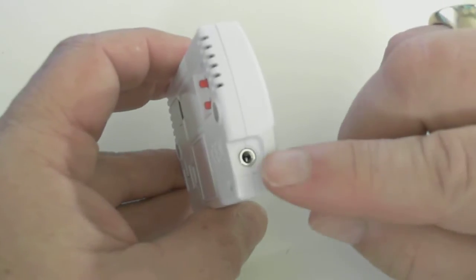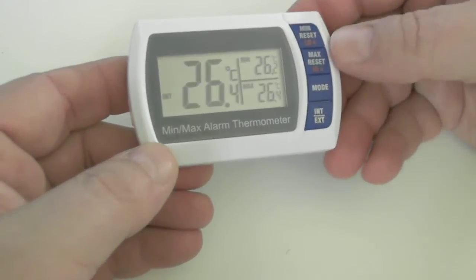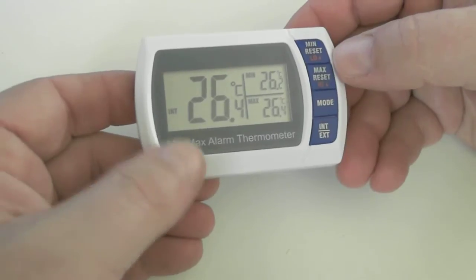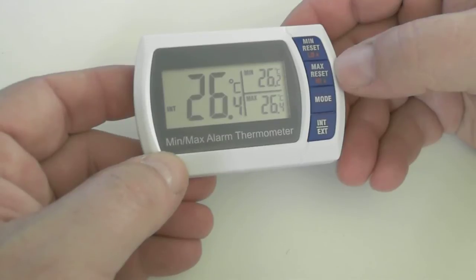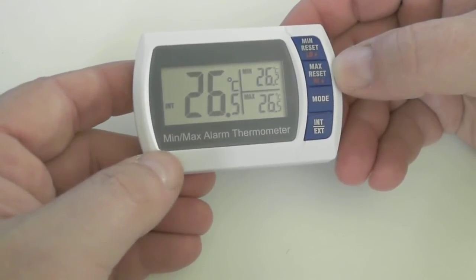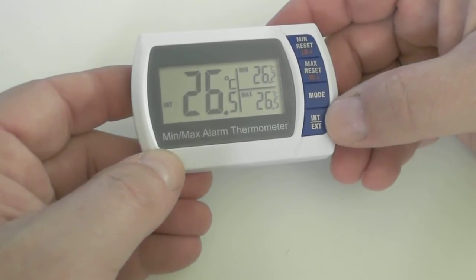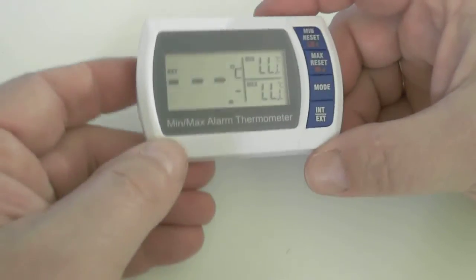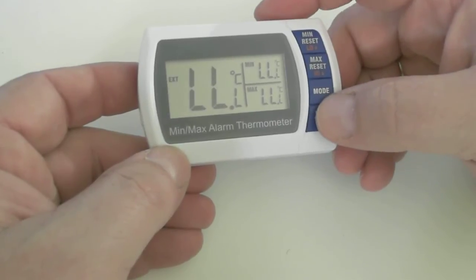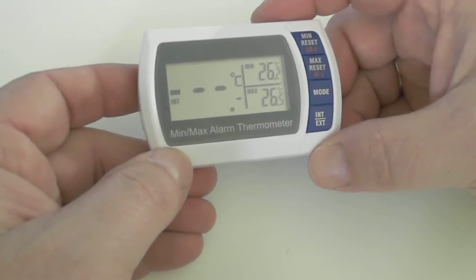Turning the unit over to the side, you have a jack that's used for external bottle probes or probes. And now to the front, we are seeing our main display which is showing the current temperature on the left and the min and max recorded temperatures on the right. You also see a symbol INT — that is telling you that you're using the internal sensor of the unit. If you were to hit the INT over EXT button, that would then switch over to the jack for the external probe and you would measure those temperatures. INT over EXT again and you come back to the internal sensor.